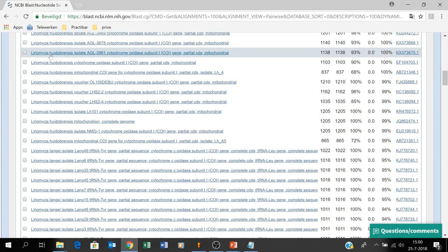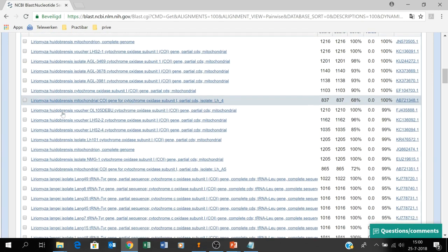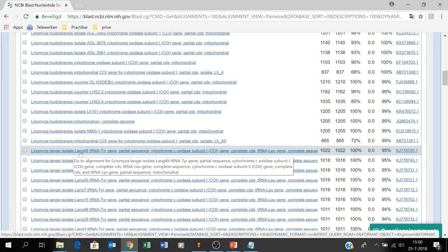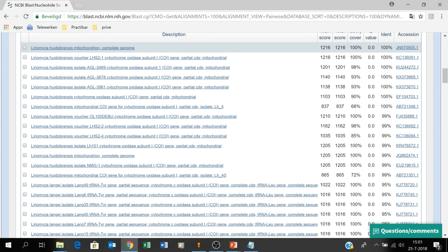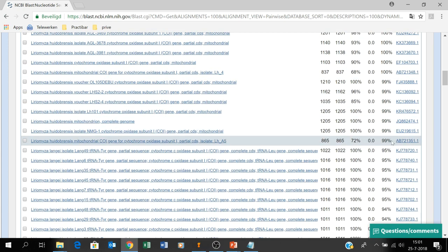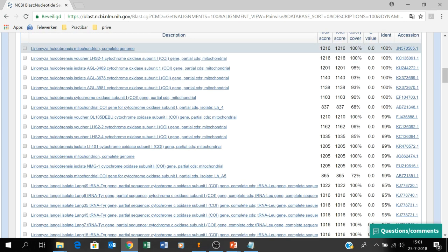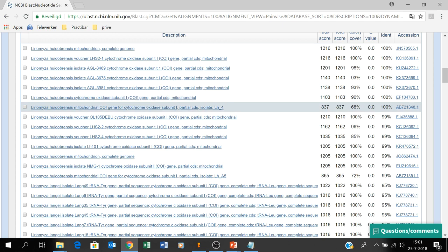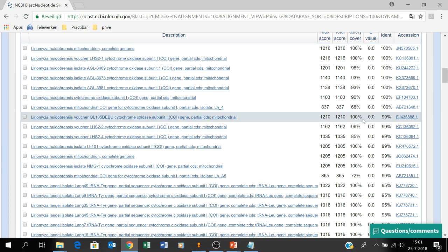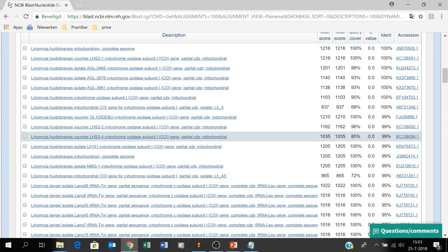You can see all Liriomyza huidobrensis entries, and then you get Liriomyza langei at about 95% identity. Liriomyza huidobrensis is 100% to 99% identical, and you have a coverage of 100% down to 72% or even 68%. Low coverage doesn't necessarily mean the sequence is very different — it's probably because the sequence in GenBank is shorter than our query sequence.